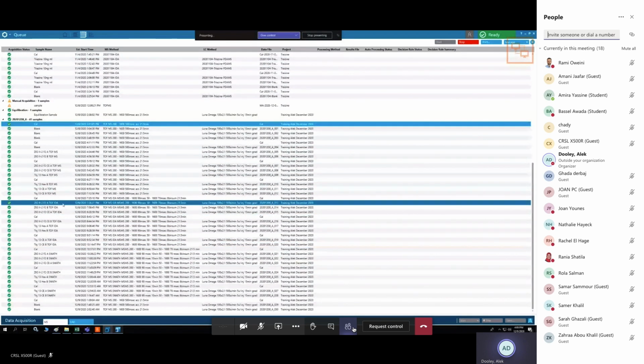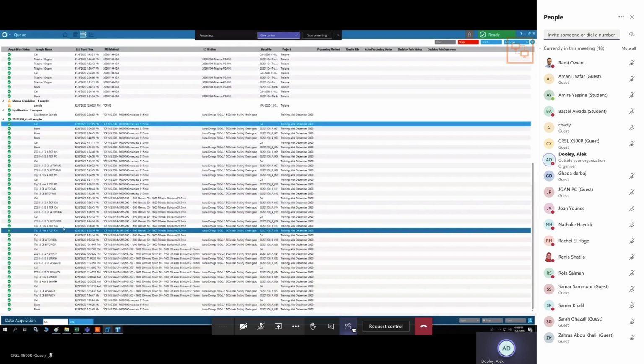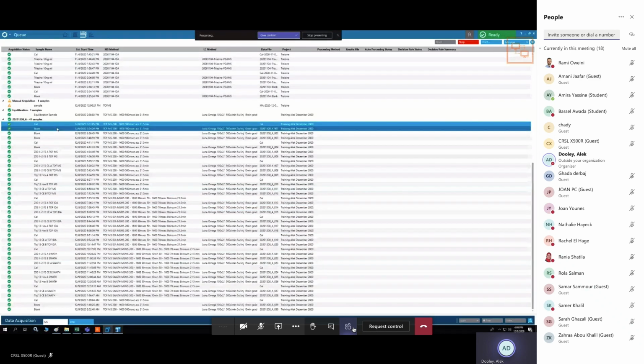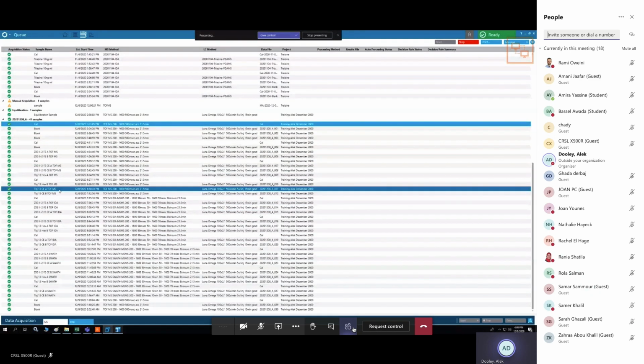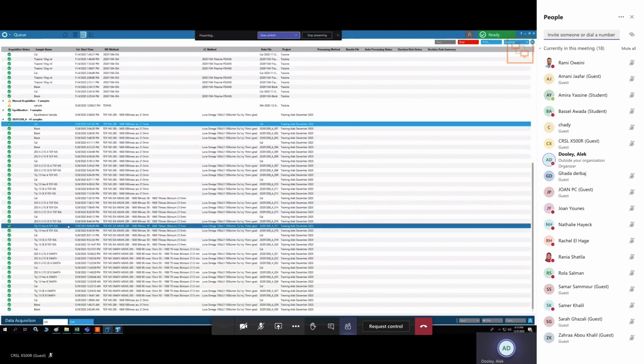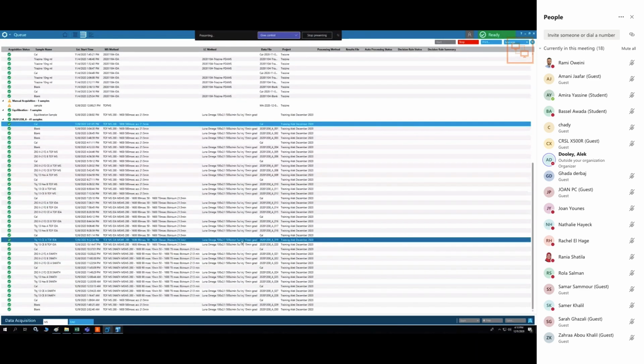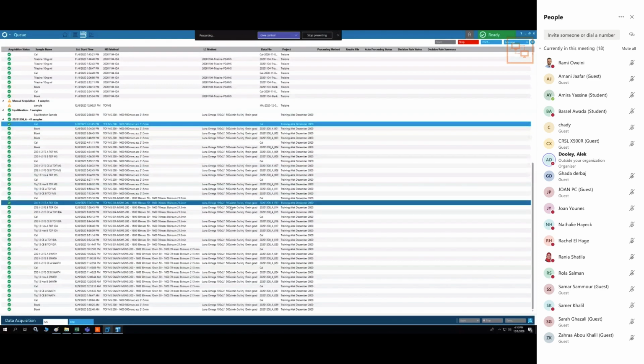So look, these are the samples that we are talking about here. They are the TOF IDA ones, and we ran them already after a couple hours of running. So probably by then the column is okay. So you have to think carefully, there has to be some drastic difference, a trace amount of solvent or something in the samples, which causes that retention time shift. Because the methods are the same, right? Where is the LC method? Yeah, look, we chose the same LC method, right, all the way along.